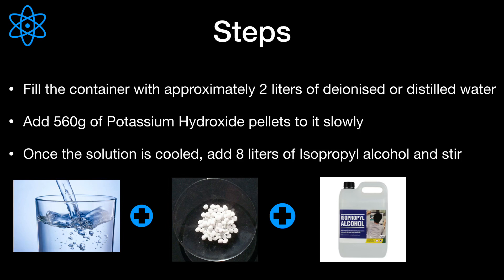Stir slowly until all potassium hydroxide is dissolved. You must wait until the potassium hydroxide solution is clear and has returned to room temperature. If you add hot potassium hydroxide to isopropanol, you can bring the isopropanol to boiling temperatures.